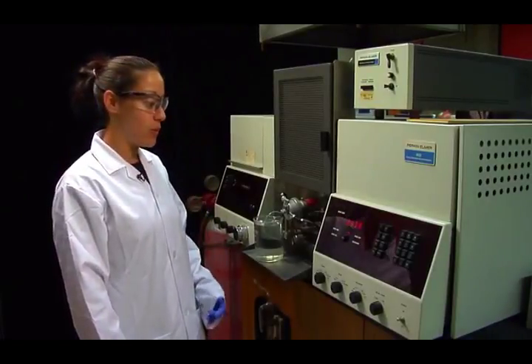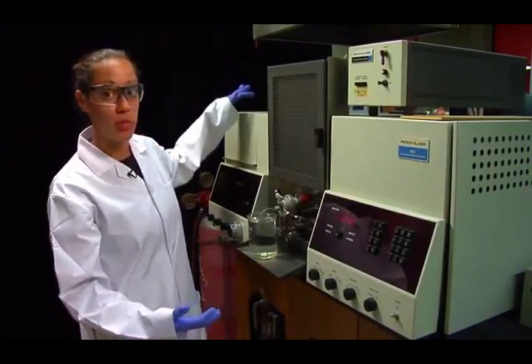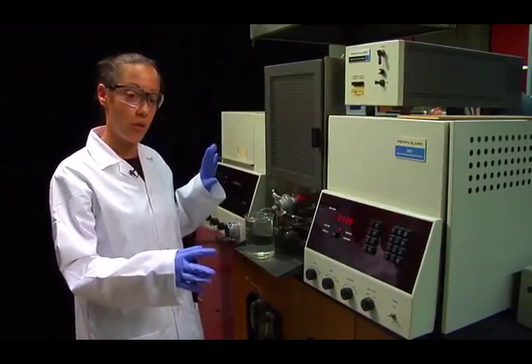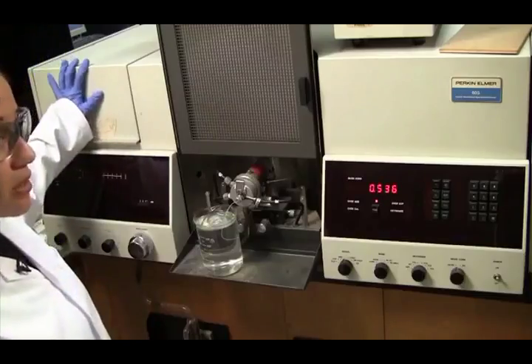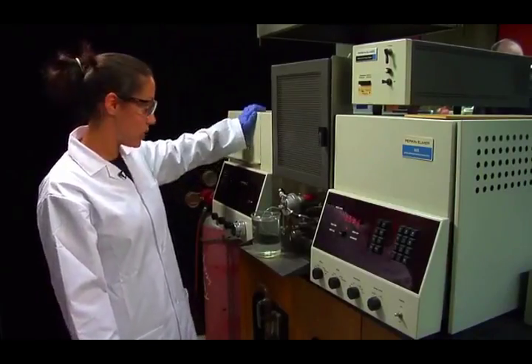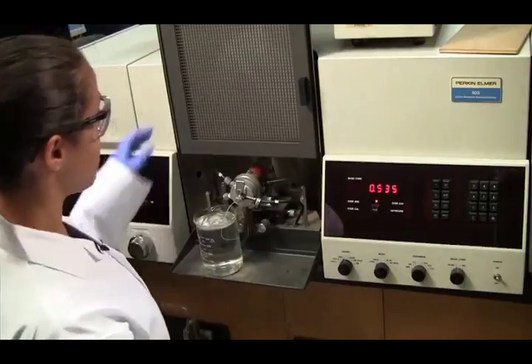Hello, so now we're going to cover how to use an atomic absorption spectrometer. So it's a pretty hefty instrument. There's a lot of components behind it, which you won't have to worry about. Your TA will have everything set up for you. So in this section here is your hollow cathode lamp, which provides your wavelength. You can also make sure the wavelength will be set here, but your TA will do that.